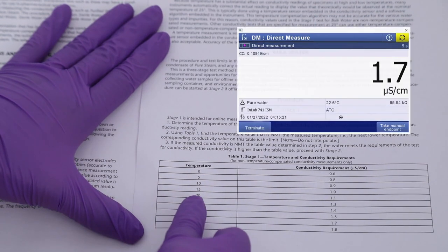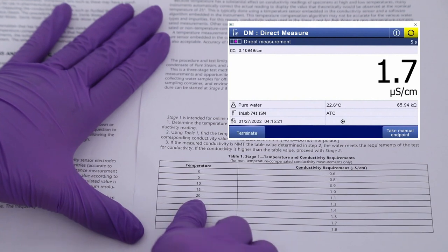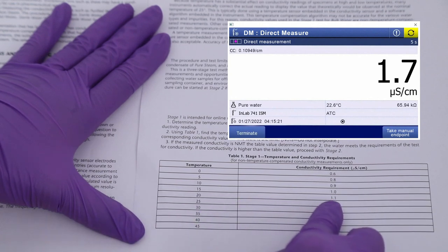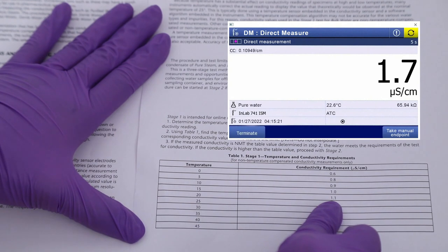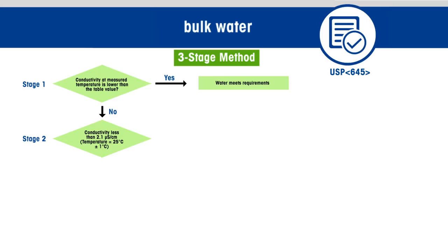In our case, the temperature is 22.6 degrees Celsius, so the next lower temperature will be 20 degrees Celsius, and the conductivity limit is 1.1 microsiemens per centimeter. Since the measured value is out of limit, we need to proceed with stage two.